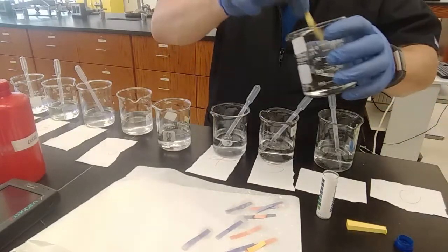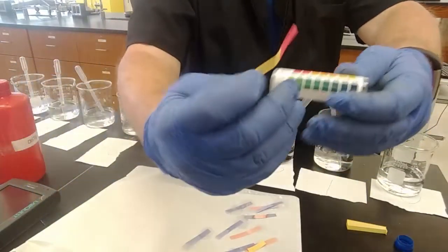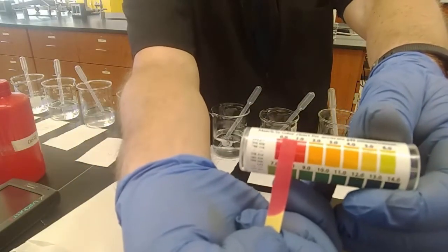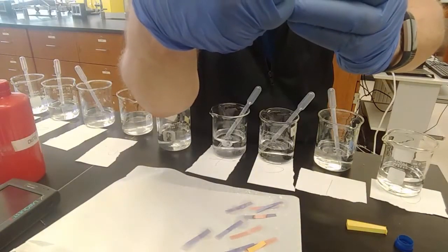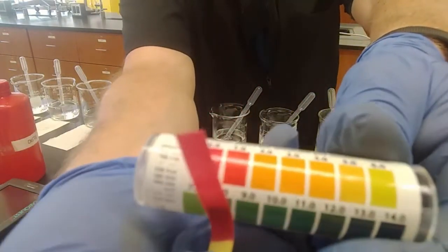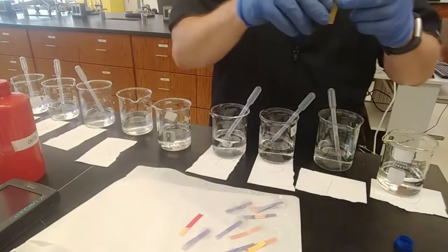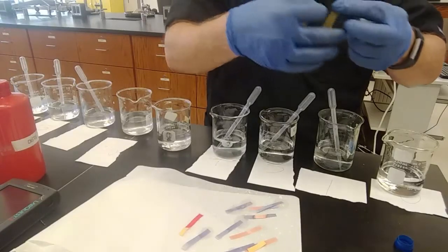Expecting pH 0. Well, it's definitely red. The question is, if we hold it up next to the bottle, is it a 0 or a 1? To me, it looks like a 0. So the universal strip for the 0 does seem to tell us that it's a 0. Okay.